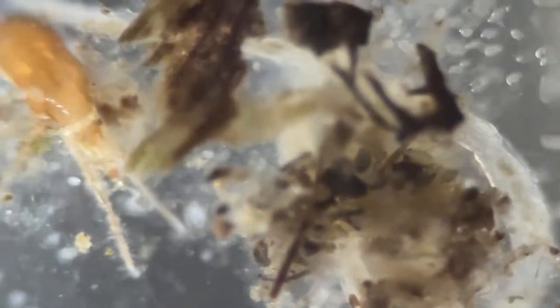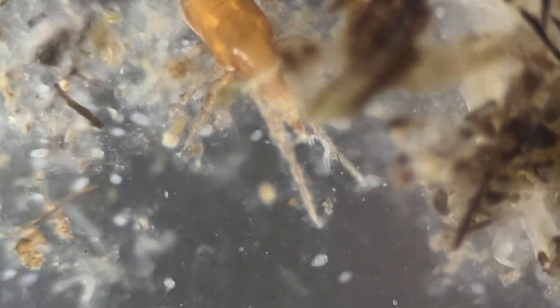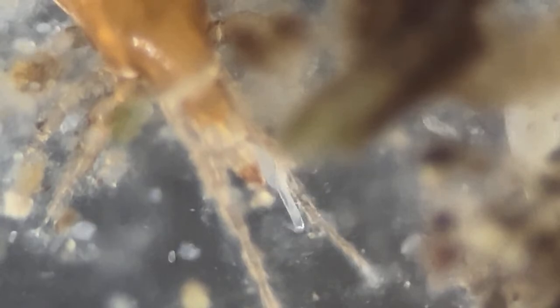It's just under the debris, so it's kind of shy for the time being. Soon it will be present. You see that little worm there, not a hookworm, but a pinworm trying to dig into some flesh of that decaying tick.